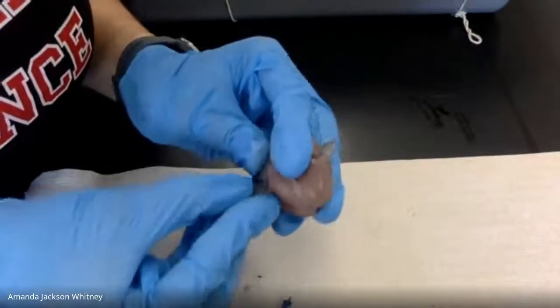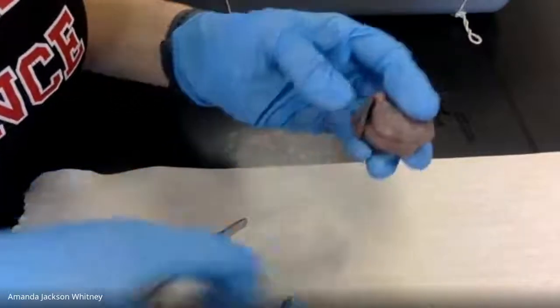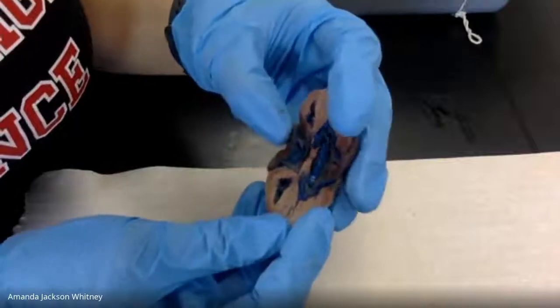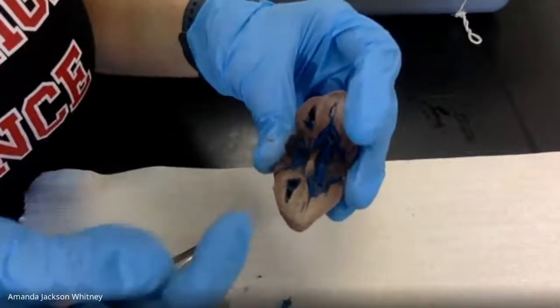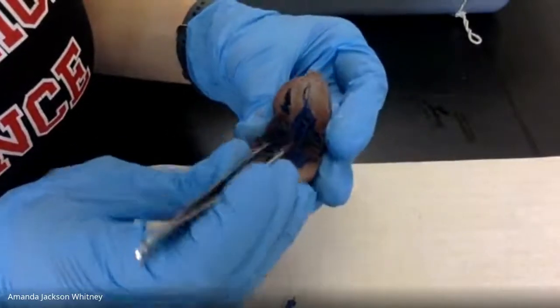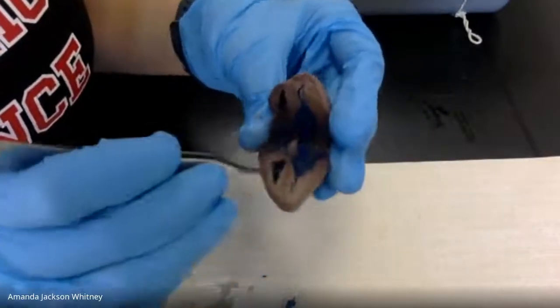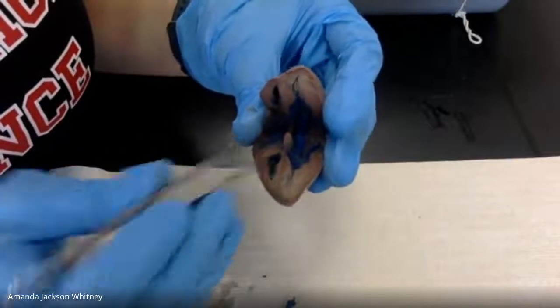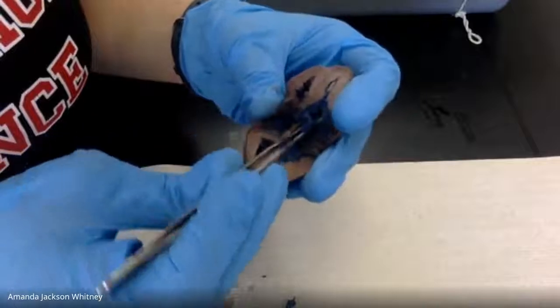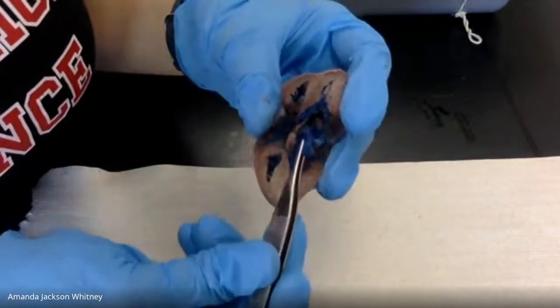The left ventricle, though, is pumping blood through the entire body. And so in order to do that, it has to have much thicker walls and, when it contracts, exert a lot more force to get all of that blood up and out. Whereas the right ventricle is just going to be pumping blood up into the lungs, so it doesn't need nearly as much force.